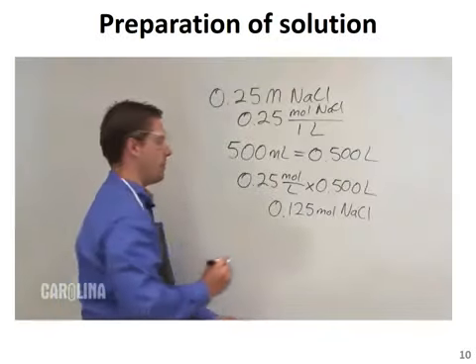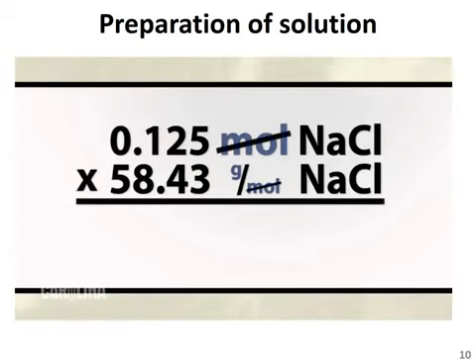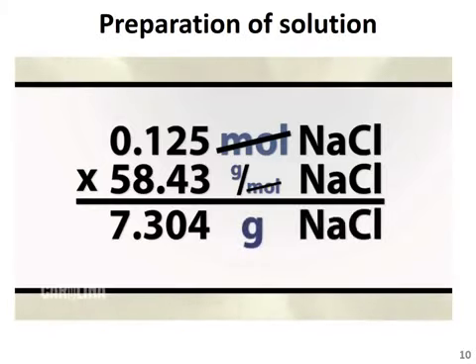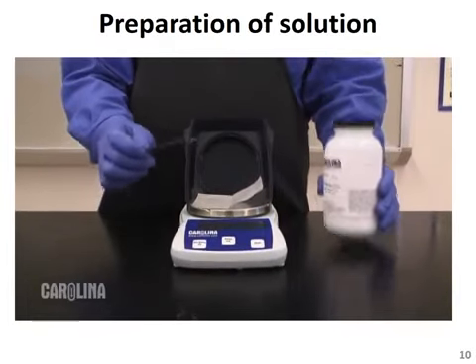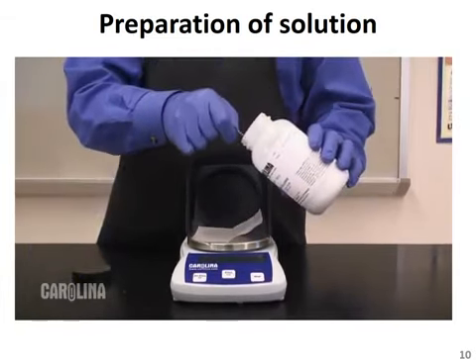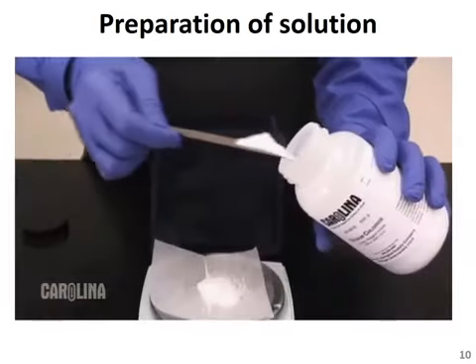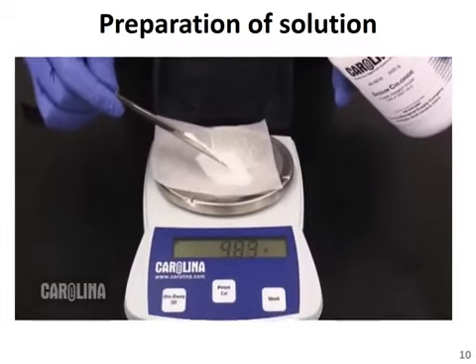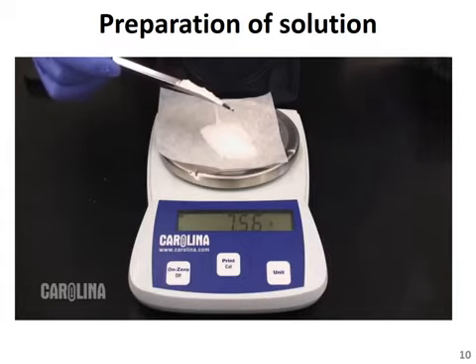From earlier, we can remember that there are 58.43 grams per mole of sodium chloride. We can determine that the exact mass that must be measured out is 7.304 grams of sodium chloride. In lab, obtain some sodium chloride in a clean lab scoop, and using a balance with some weighing paper, measure out as close to 7.304 grams as possible, marking down your exact mass. Note that if you go over the desired mass, it's never appropriate laboratory procedure to put the excess reagent back into the original container.